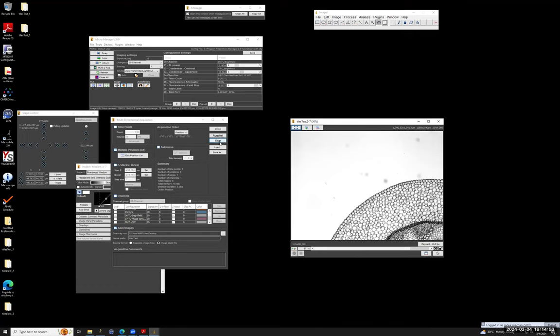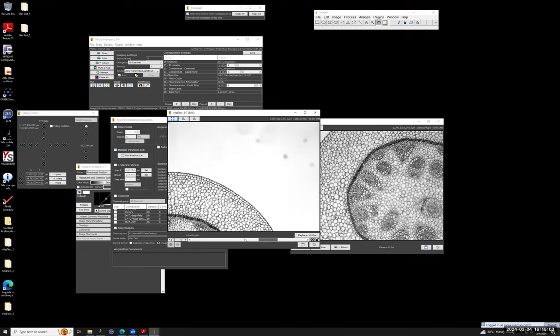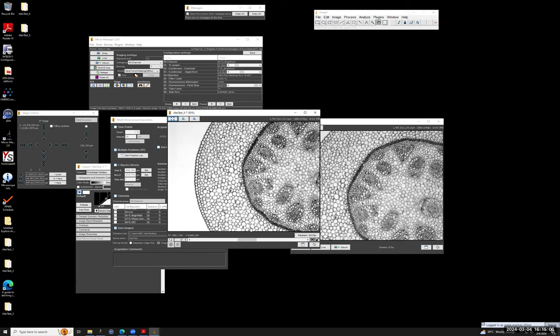And now comes something that could be a bit of a problem. It's not so convenient, I would say, here in Micromanager, and that is stitching the images, because you might be used from commercial microscope software that they might stitch the images for you on the go. Now there's no such feature in Micromanager. What we can do is use stitching plugins that are available in ImageJ Fiji.